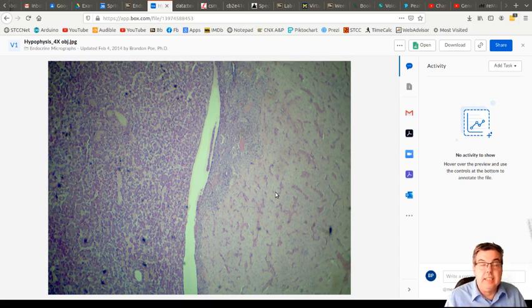The darker staining cells are going to have more RNA in them through having ribosomes and mRNA and that sort of thing, to make proteins, whether it's protein hormones or enzymes to make non-protein hormones. And then light staining tissue is light because it doesn't have all of that protein machinery in it, and it just is going to stain lighter.